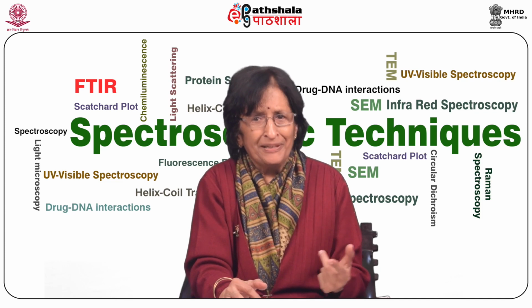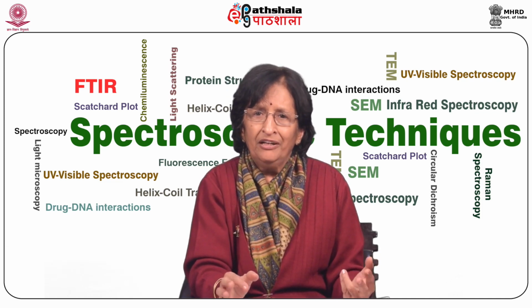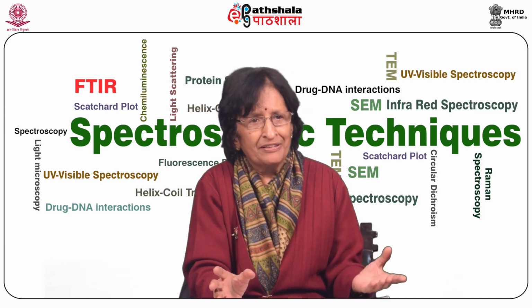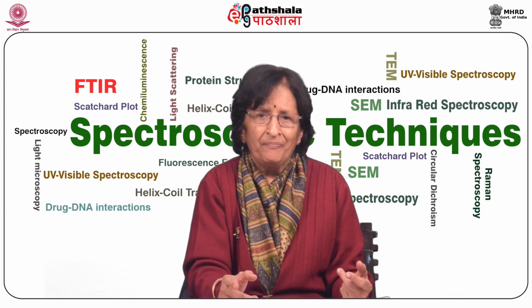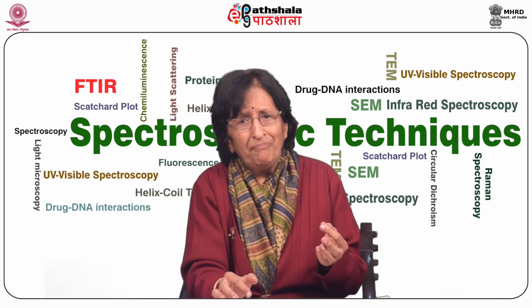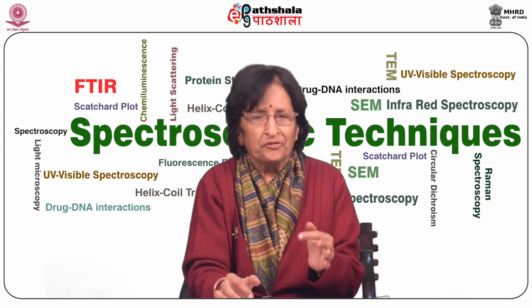The spectrophotometer can be attached to a telescope to measure a spectrum emitted by astronomical objects. Astronomical spectroscopy is a very, very important field. Also, it is possible to do microspectrophotometry by attaching it to a microscope.